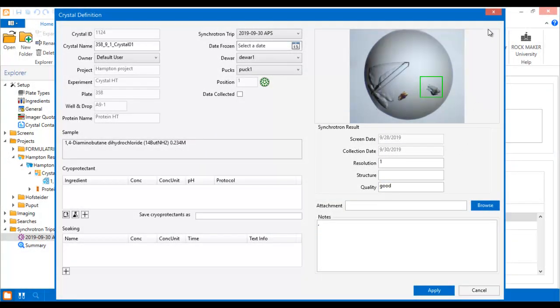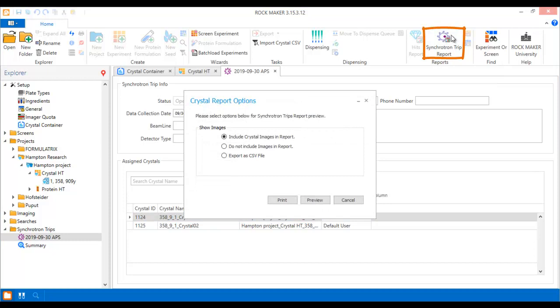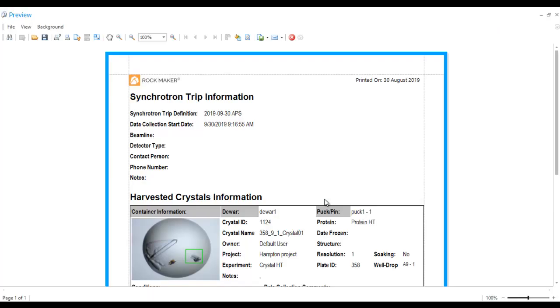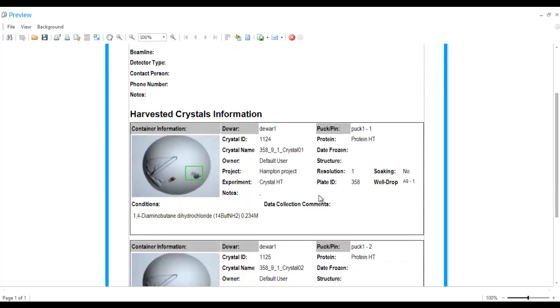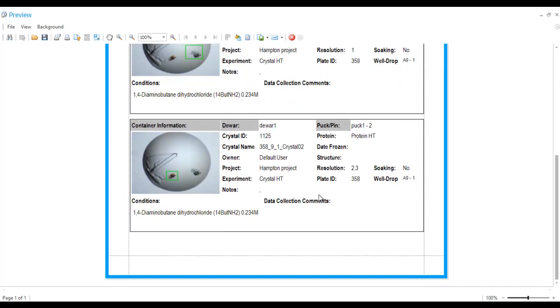Now that you have input the results of your synchrotron trip in RockMaker, you can once again create a synchrotron trip report for your own records. The report now contains all of your trip results in addition to all of the other data that was there before.